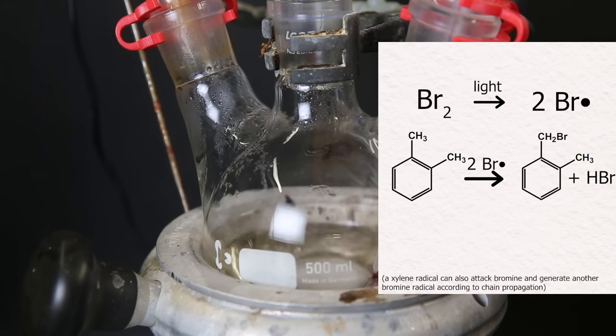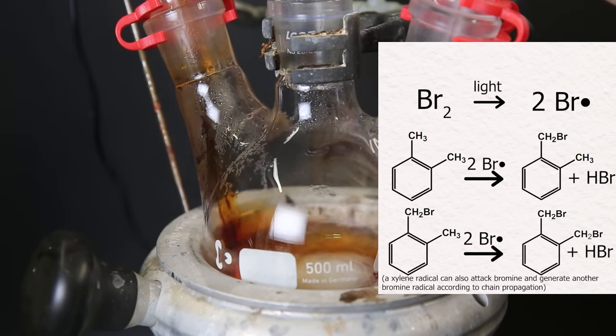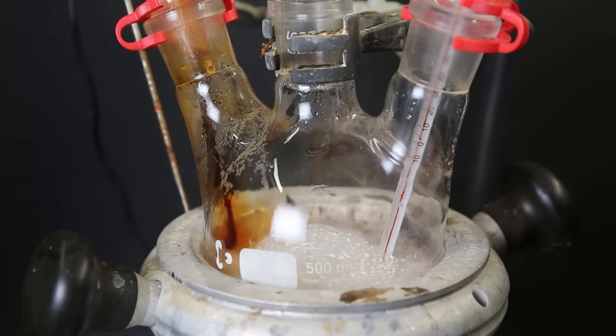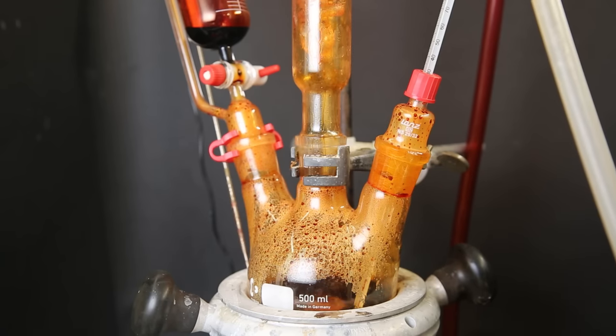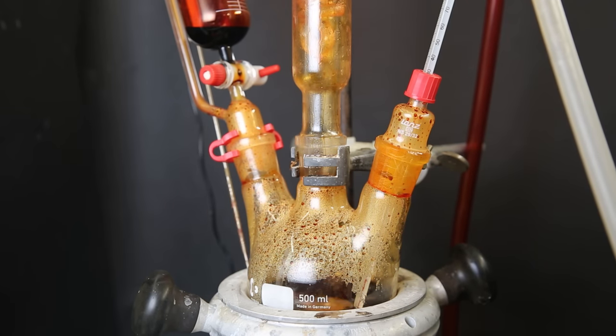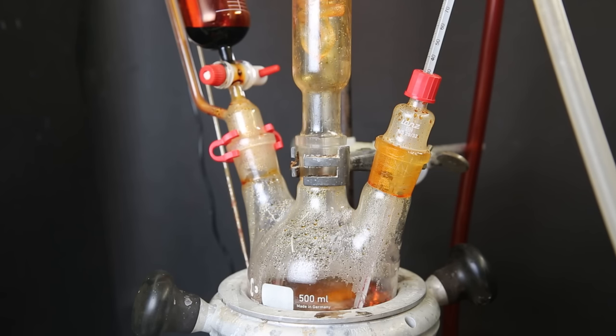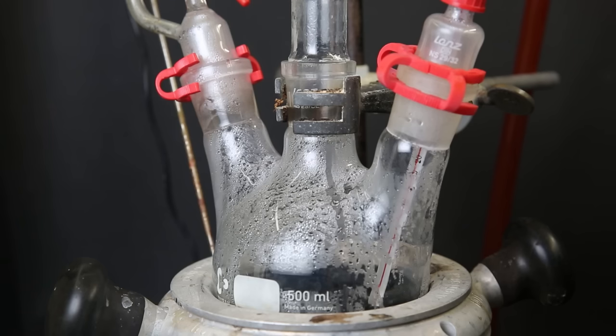The bromine vaporizes easily because of the heat, but it seems to also react with xylene in the gas phase, so it's not really a problem. Now when the temperature is too low, the bromine won't react, so it's important that the xylene keeps boiling. When it is brought to a boil, we can see the bromine disappear again, and I can start adding more. When all of the bromine has been added, I leave it to boil for 30 more minutes.